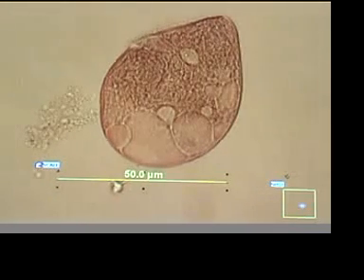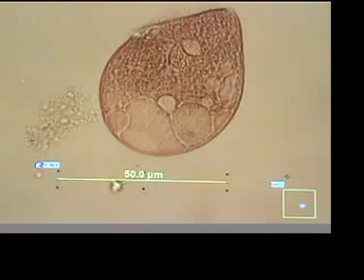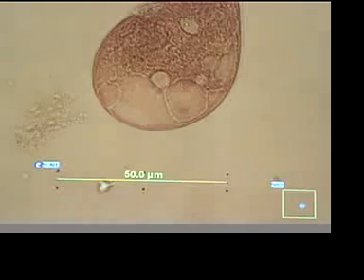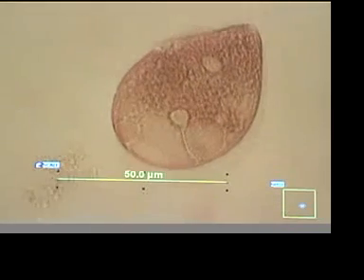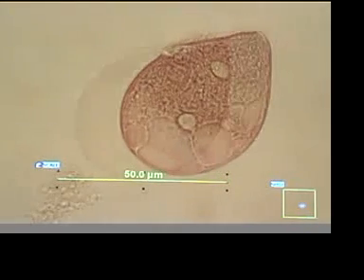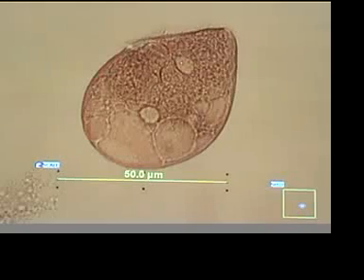He is moving slightly upwards in the picture, so he seems to be capable of a little directed motion still. But the F-125 is going through a series of frequencies, so we'll see. I'm going to chase him a little bit here. He is moving up on the slide. This is real time.